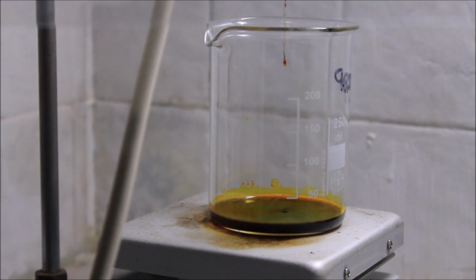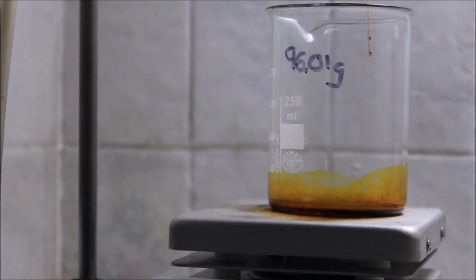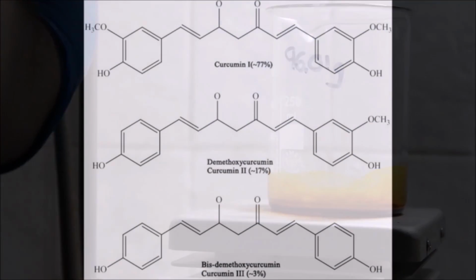The last amount of solvent was removed by flushing air through it. Once it is completely dried, the crude curcuminoids product is a red-brown solid. Actually, the crude product is a mixture of mainly 3 components shown in the following picture.